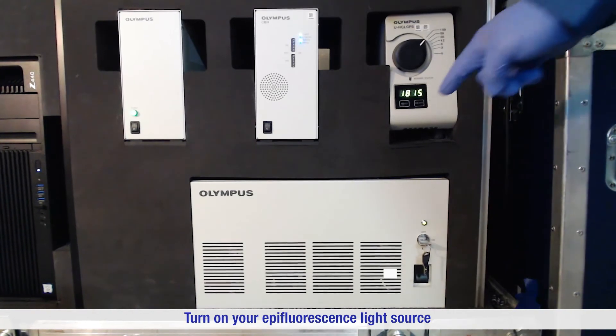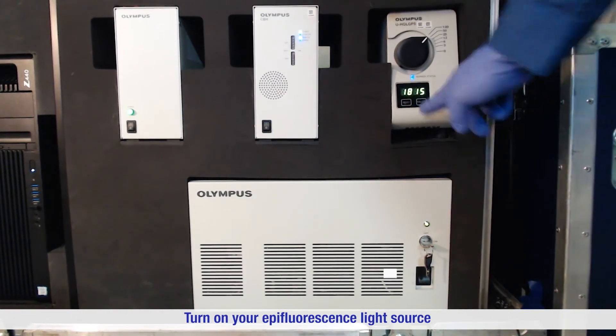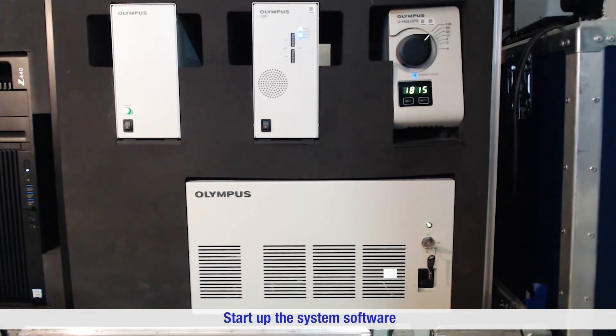Turn on your epifluorescence light source. You can now start up the system software.